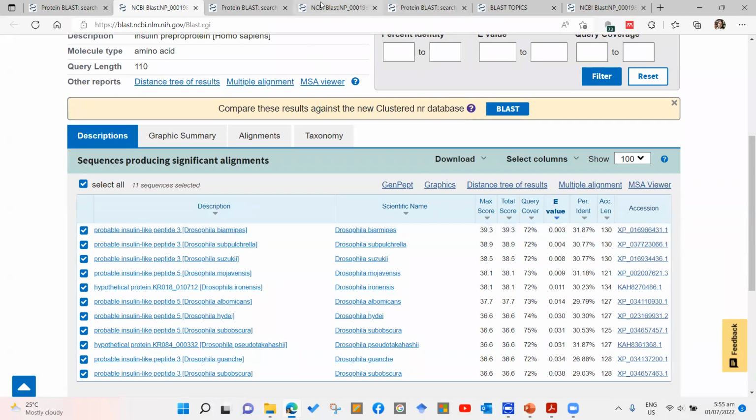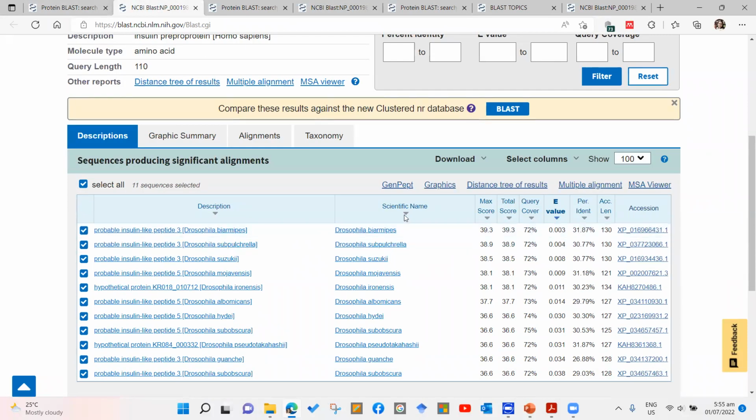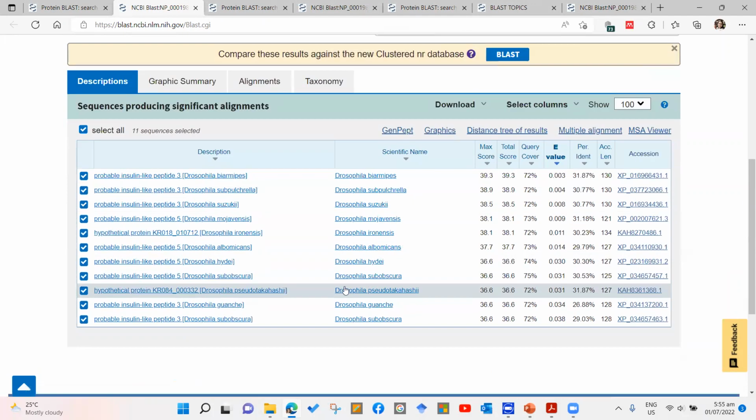If there's no adjustment, you might have a false positive. This one is ultra high sensitivity, so it has stricter scoring values or scoring limits. So you have a lower e-value. Basically these are the differences. But anyway, the general rule is to just use conditional adjustments, basically the middle of the two extremes.